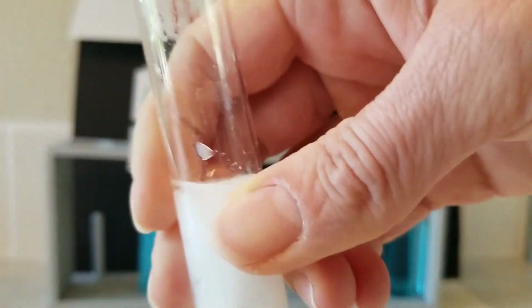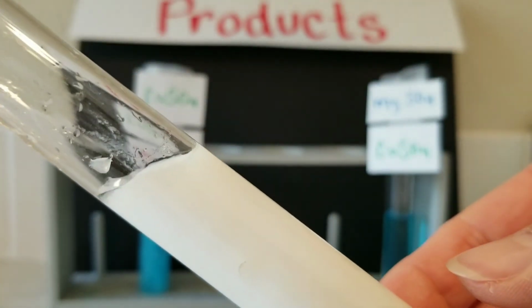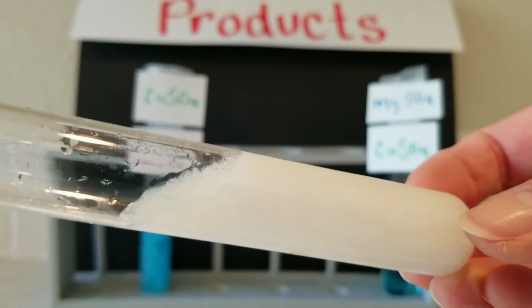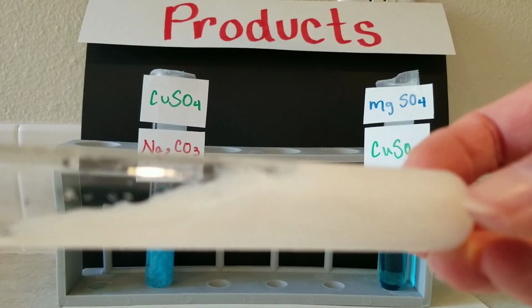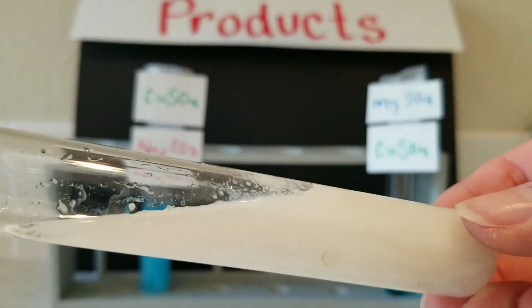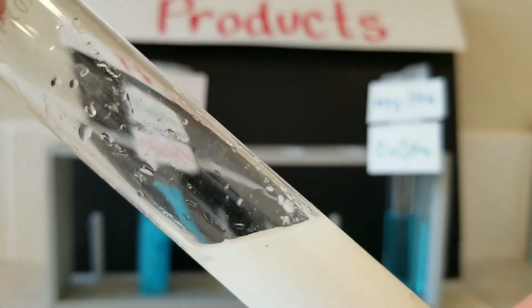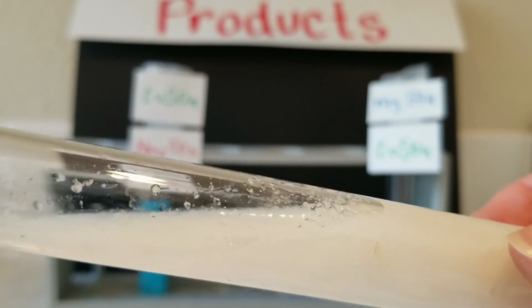I'm going to go ahead and take the label off and just tip this for you guys so you can see how different the substance is, how thick and chunky it is rather than being watery like we started with.